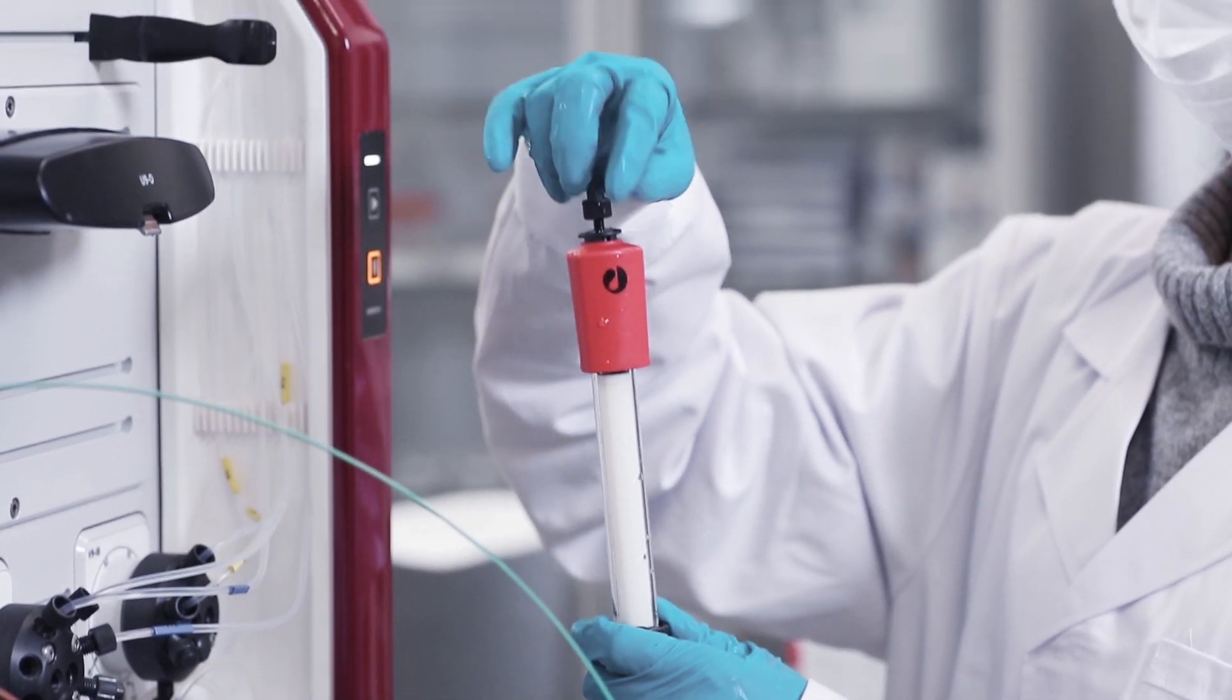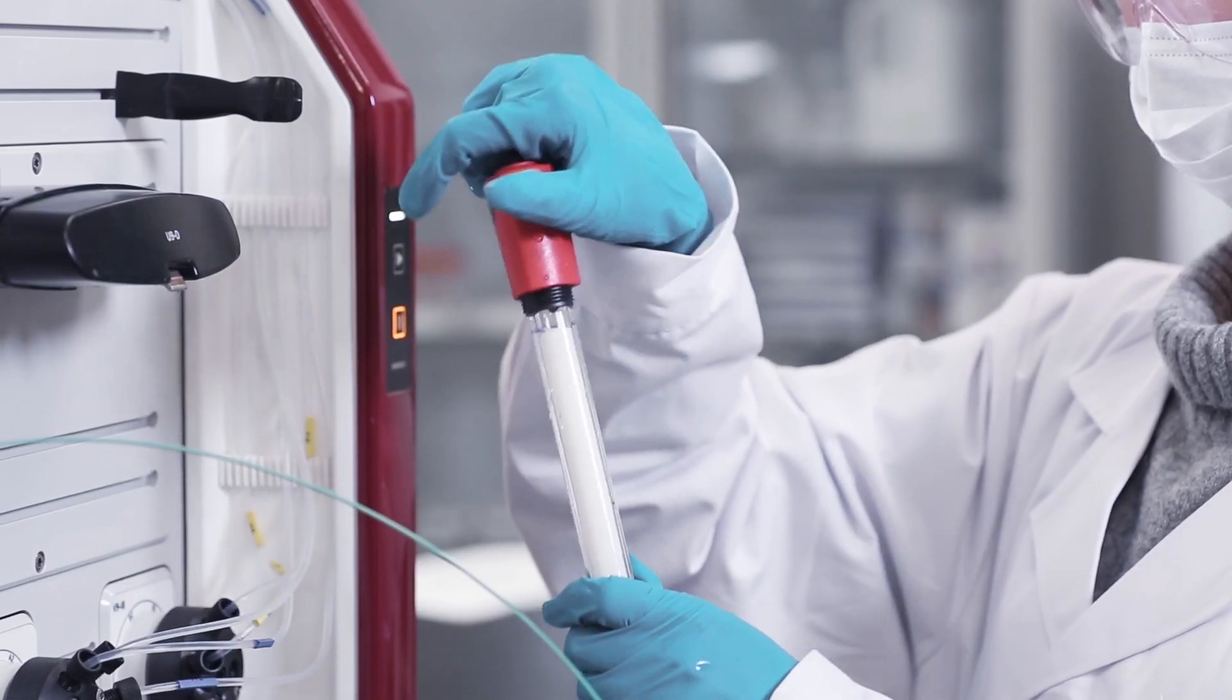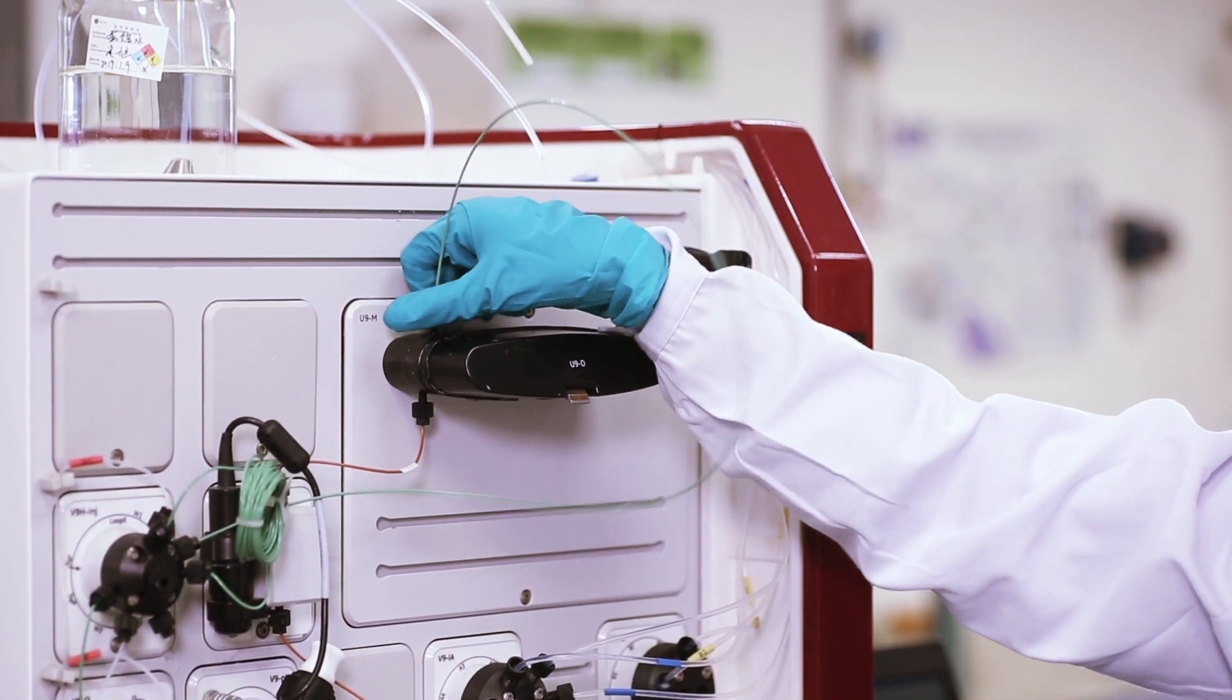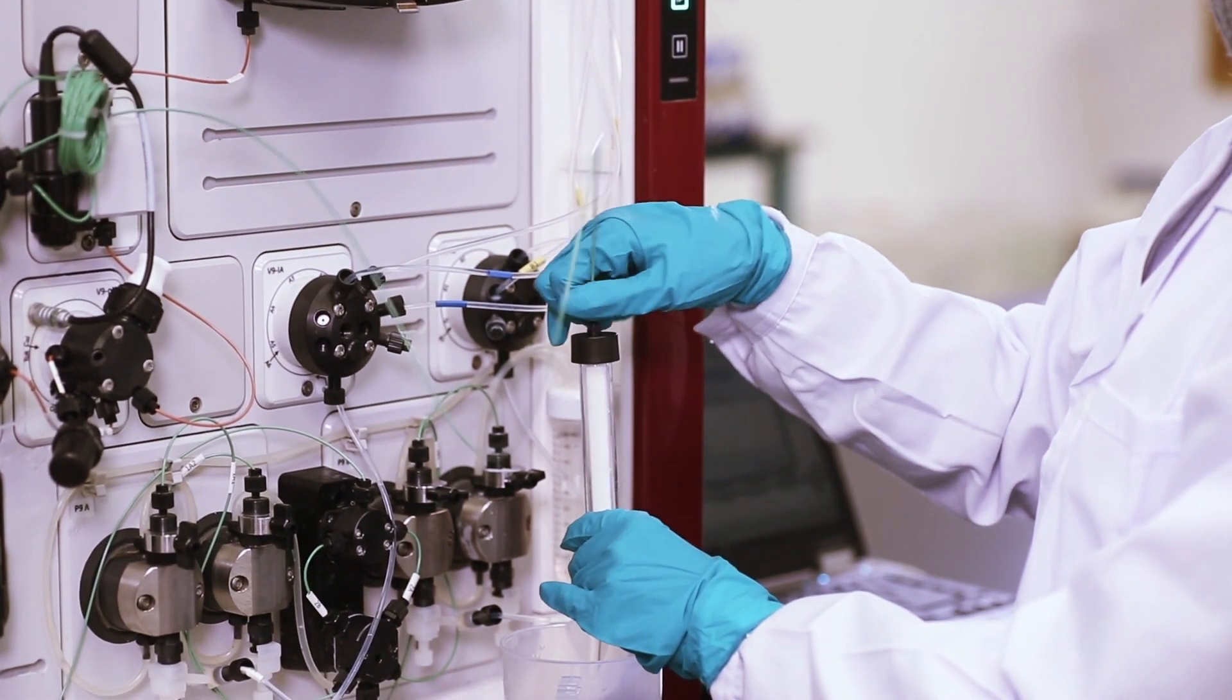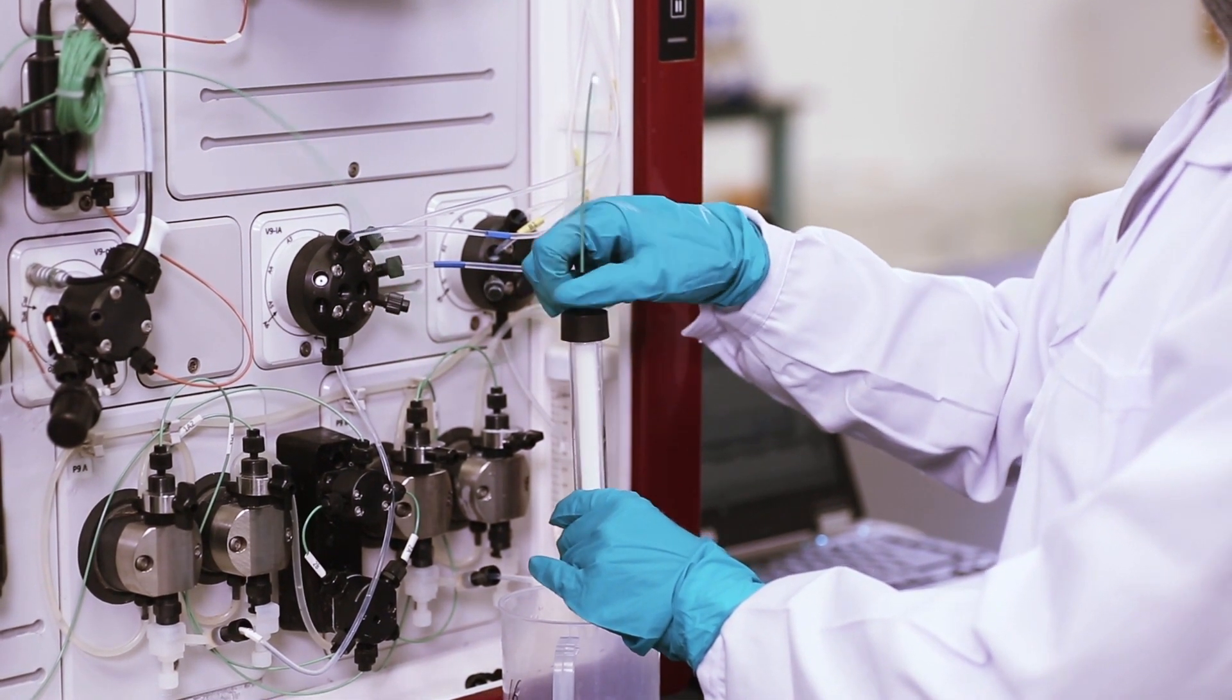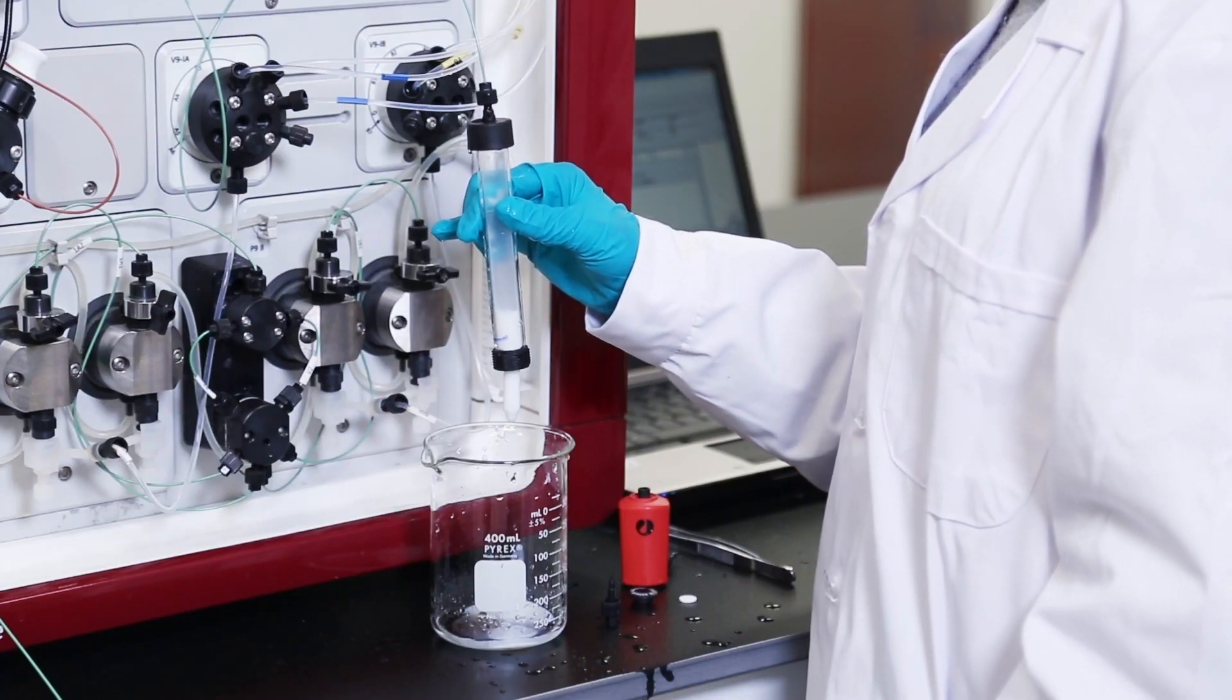Part of the packing process includes an efficient way to unpack the column. Remove the stop plug on top, remove locking ring, top adapter, and filter. Set appropriate pressure and flow rates in Unicorn. Place a beaker under the column and flush out the resin from the column using liquid flow. Your column and resin can now be reused.